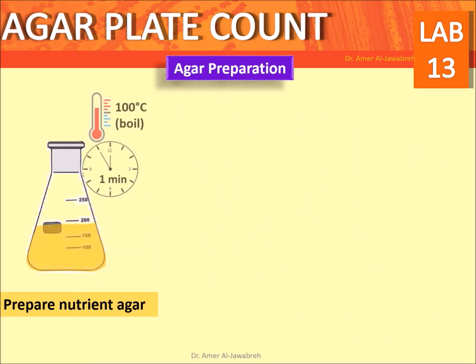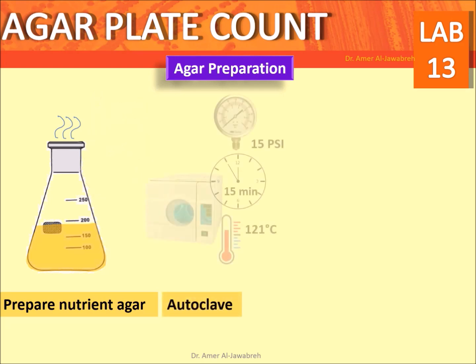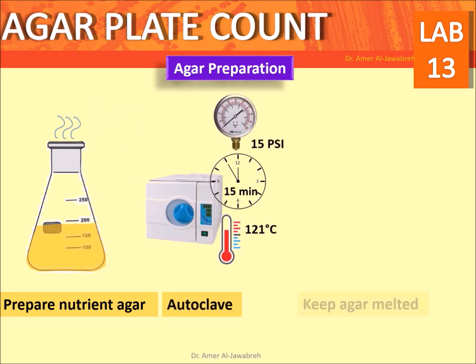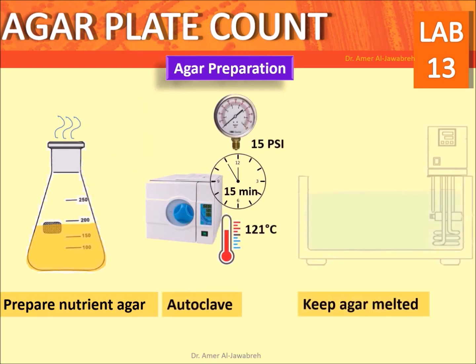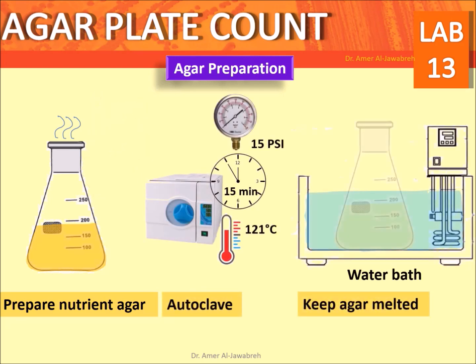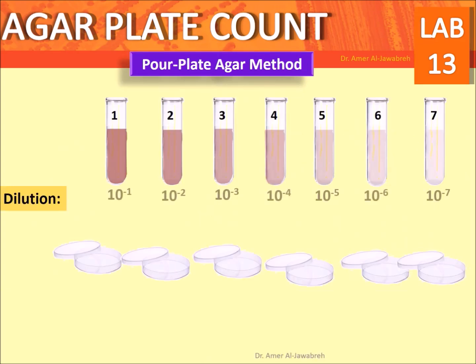Agar preparation: prepare nutrient agar by boiling for 1 minute. Autoclave, then keep agar melted at 45 degrees centigrade. Pour plate agar method.